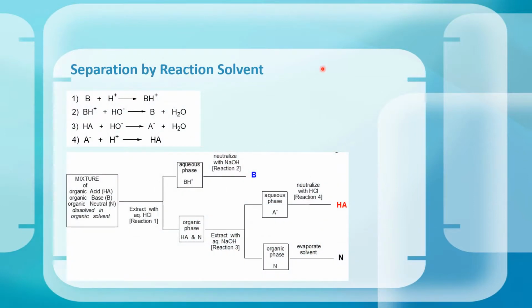As far as how we go about it to get the aqueous, usually if you've got some solid in there, it's probably some kind of a carboxylic acid or some kind of an amine or something like that. And so what's useful in those cases is to use a reaction solvent. So we'll pick something like HCl or ammonia or sodium hydroxide, or it just depends on what you're trying to do exactly, but any of those things could really work. We typically use strong things though, like strong bases and strong acids, so it'll usually be like HCl in our lab or sodium hydroxide, and it's not usually super concentrated either. It doesn't necessarily have to be.